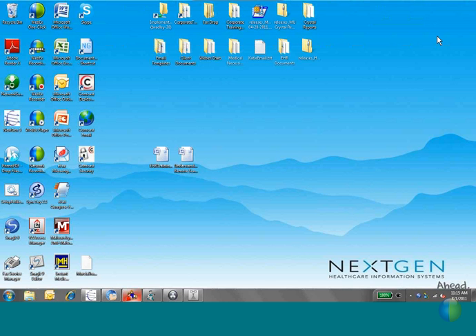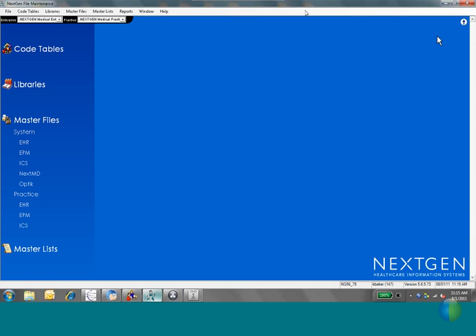So the majority of what you're going to set up is in file maintenance. So we're going to spend a good amount of time here. Let me check my chat board before I go on to that.